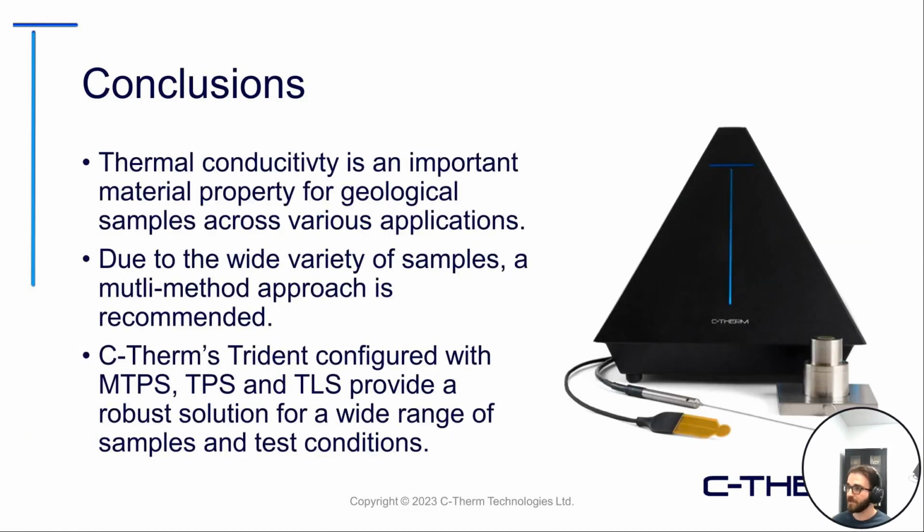All right, so that kind of comes to getting close to the end of our session, but just a few concluding remarks here. One of the big takeaways, of course, is that thermal conductivity is an important material property for geological samples across various applications. Whether it's geothermal energy, extraction, what have you, thermal conductivity is one of the most important properties of interest, along with other factors such as heat capacity, thermal diffusivity, and others.